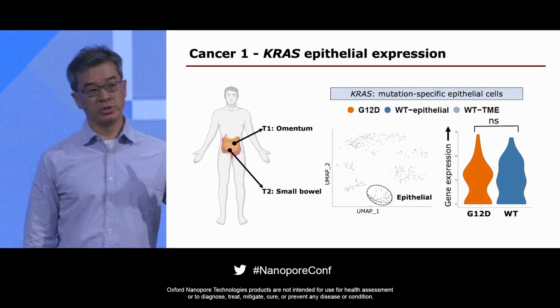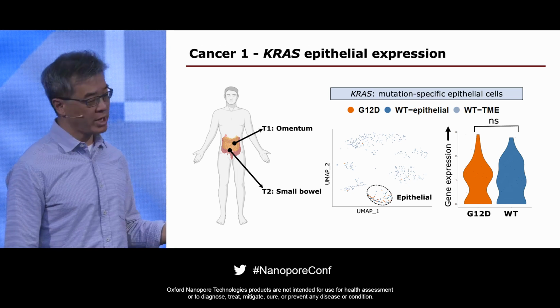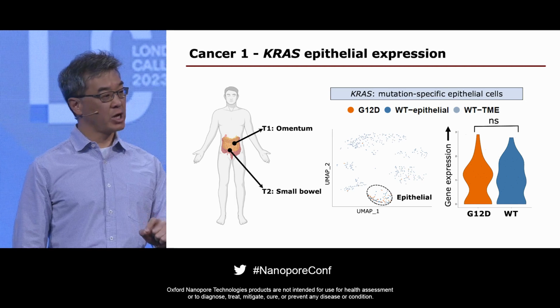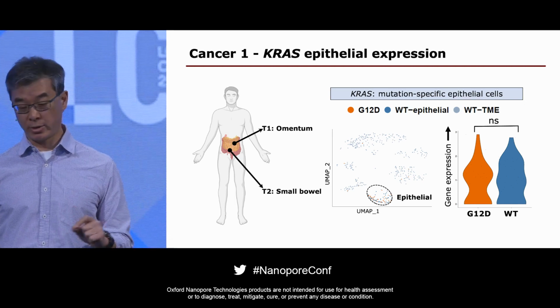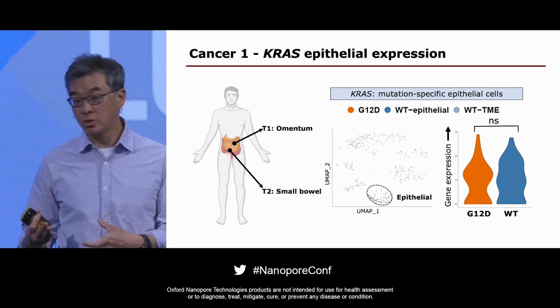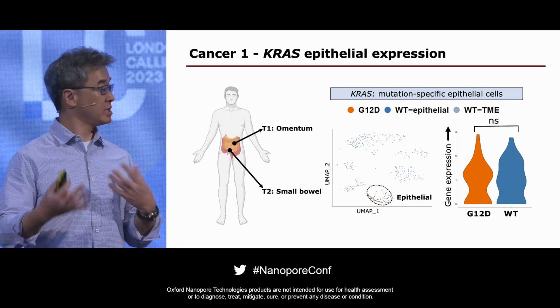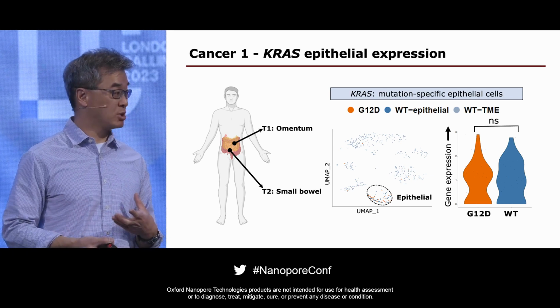The other thing you can do is you can take advantage of this information and begin to think, are there impacts from these variations, these somatic variations that somehow destabilize the transcript? And so this is something that allows you to actually test the consequences of these mutations and variants such that you can assess, well, is that actually still expressed in relatively the same levels or not?